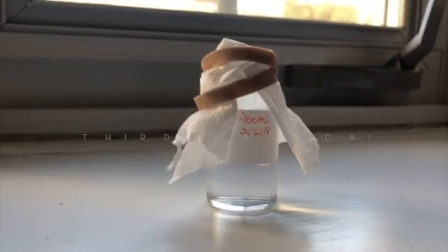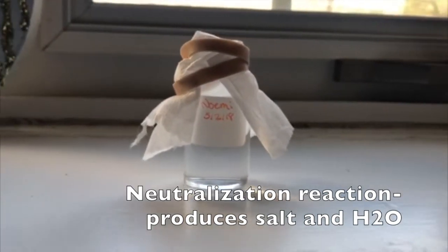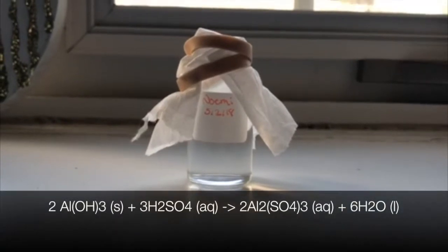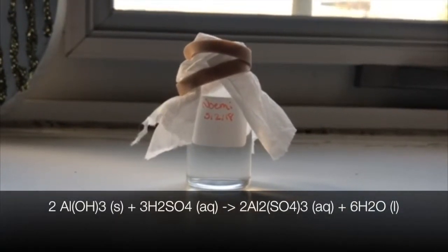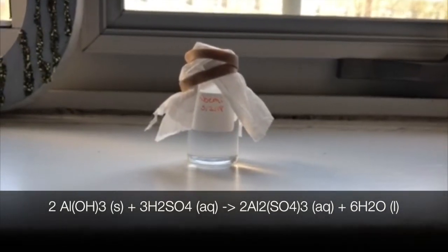The third reaction, we saw that the additional sulfuric acid neutralized the basic aluminum hydroxide precipitate, and this caused the solid hydroxide to dissolve and form aqueous Al2(SO4)3. This can be represented by the following chemical equation.